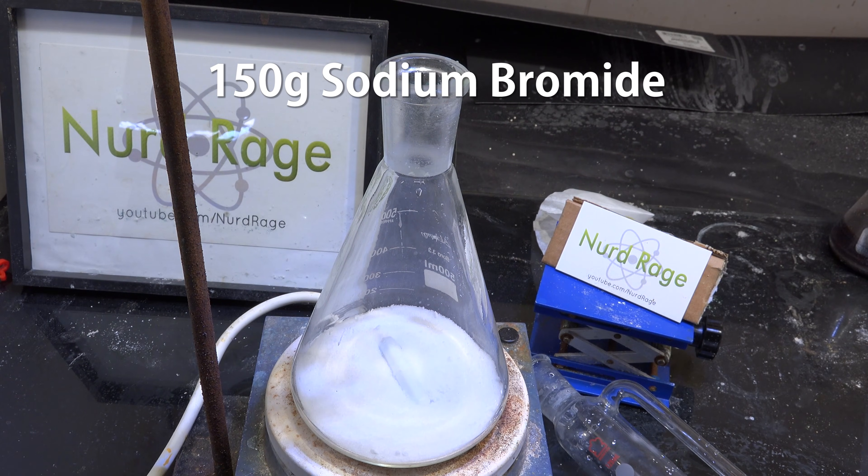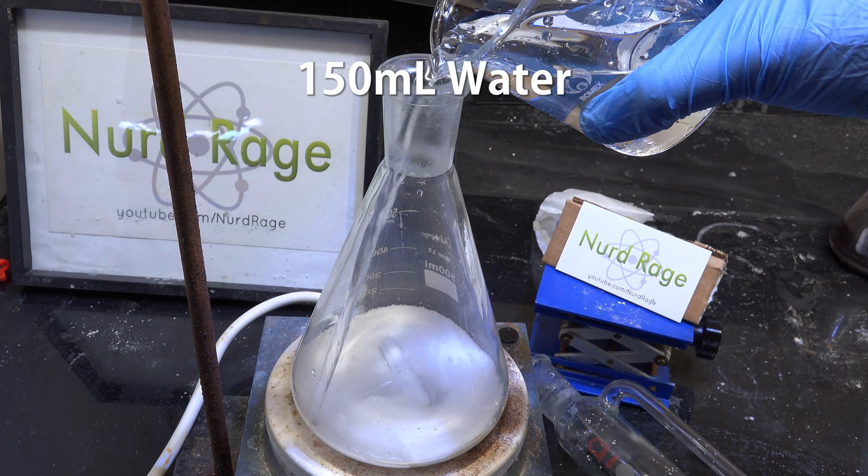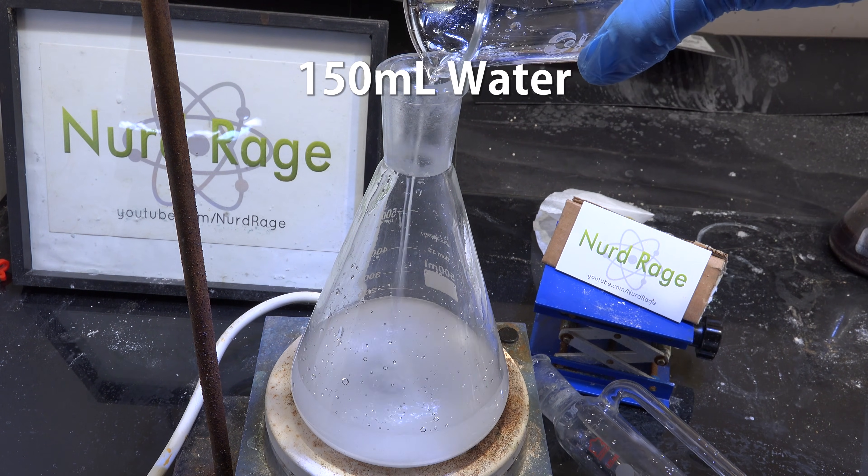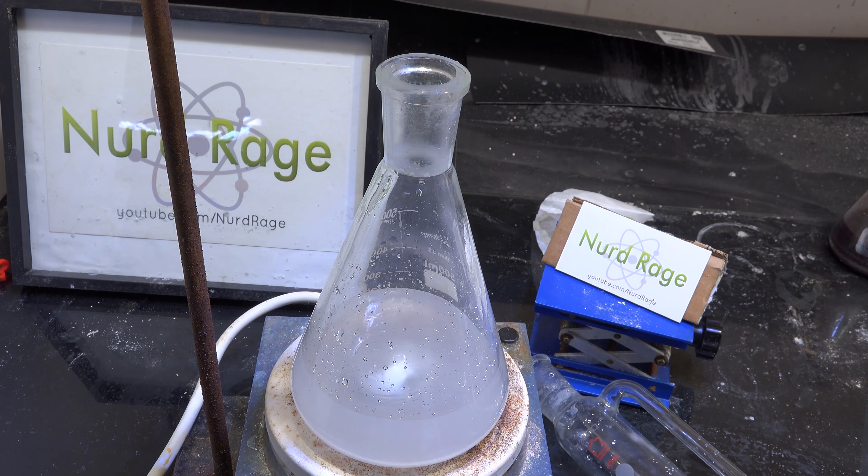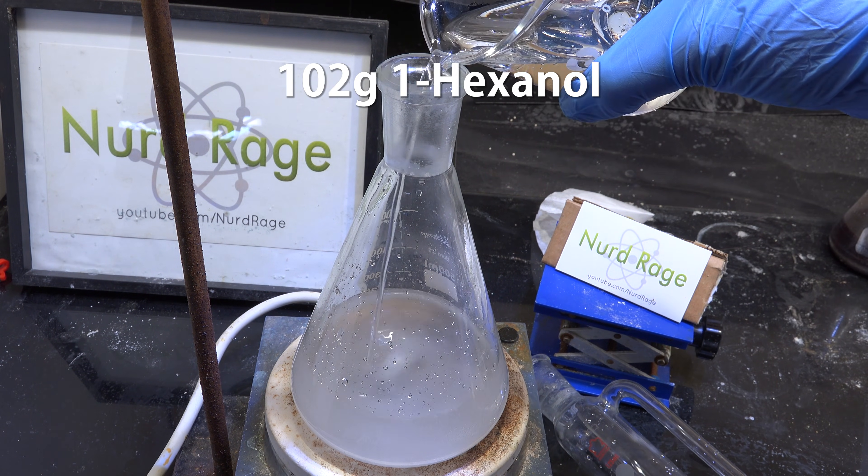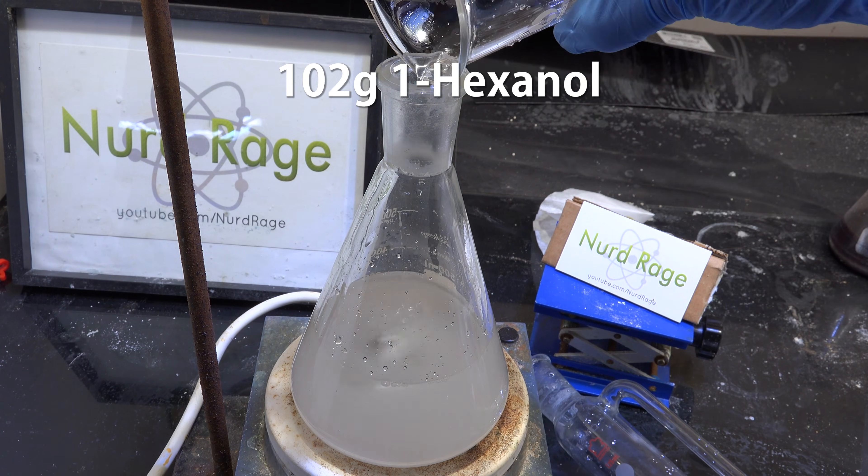First we get 150g of sodium bromide. This will be our bromide source rather than hydrobromic acid. Then we add in 150 mL of water and stir until most of it is dissolved. Depending on temperature it may not completely dissolve but this is acceptable. Now we add in 102g of 1-hexanol. This is the alcohol we'll be converting into an alkyl halide.